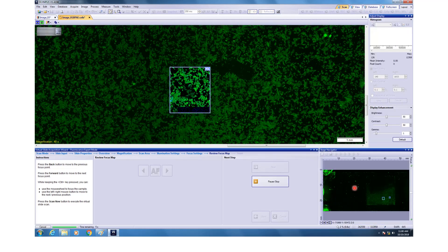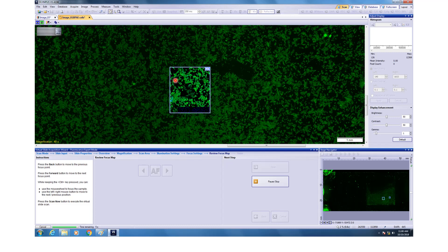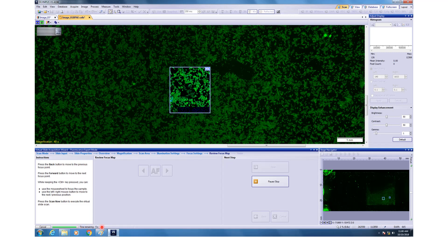After the scan now button is clicked, it will start doing XY scans and stitch all the images together. And I captured this image while it was acquired. You can see that the green has been done almost till here and DAPI has already been done. And you can see the rough amount of time it will take, but I don't rely upon this number because it is a lot of times misleading. If you want to calculate how much time it is going to take for your batch, you do it for one slide and then multiply it for all. You don't depend upon this number.